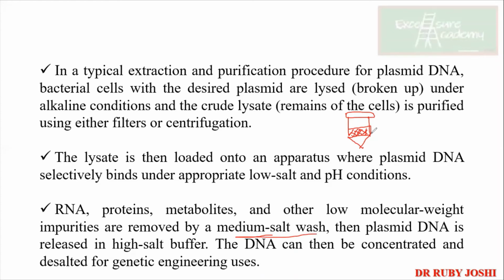Now you want to purify plasmid DNA. So plasmid DNA will be eluted using the high salt buffer. Okay. Now, what is the chemistry behind using high salt buffer? Can anyone tell me?